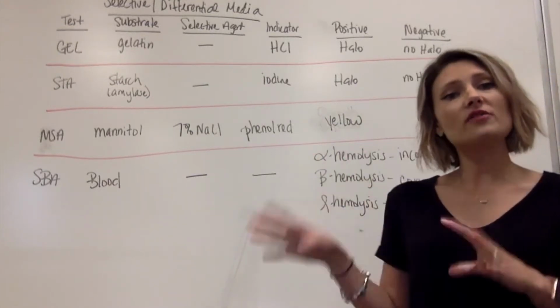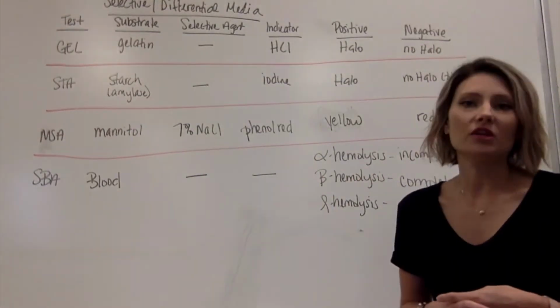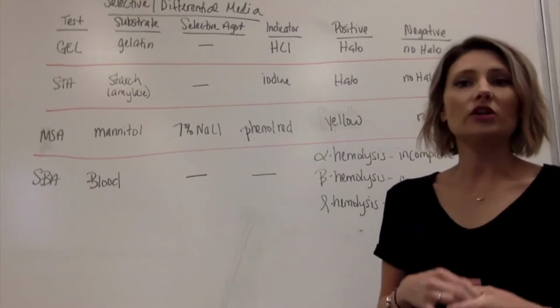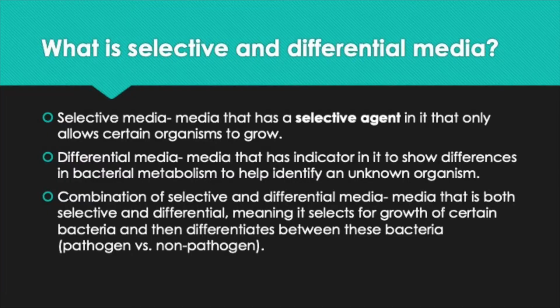And like I said, all of this is in your lab manual, so if you want to follow along or just take notes from me talking, you can definitely do that. So the first test that we are looking at is the gelatin test, or GEL for short. But before we go over that, let's go over what selective and differential media actually is.